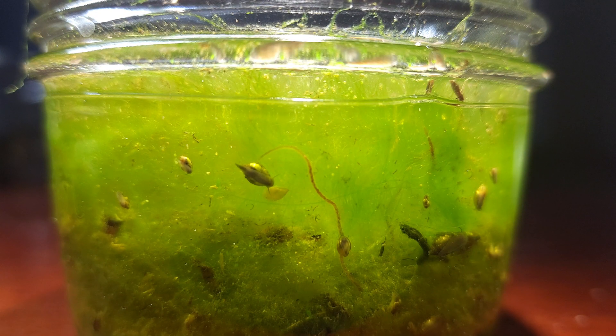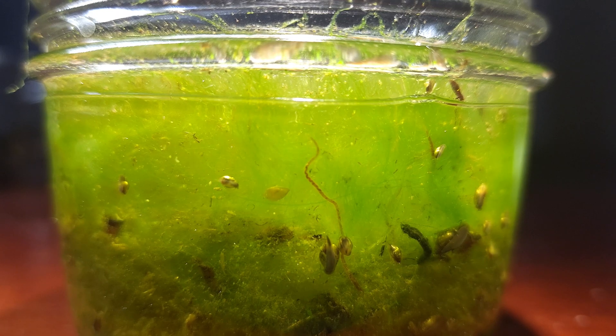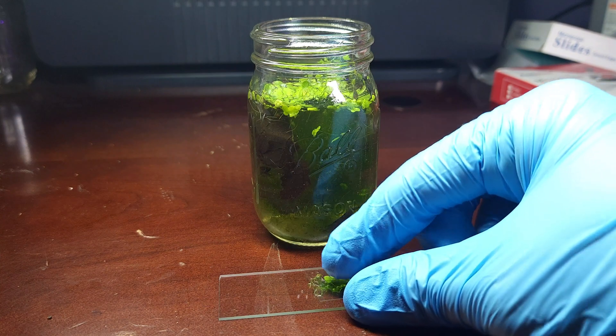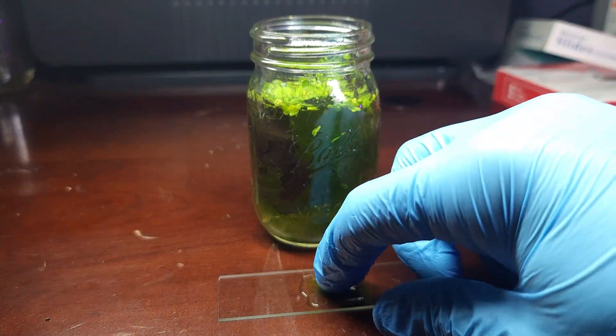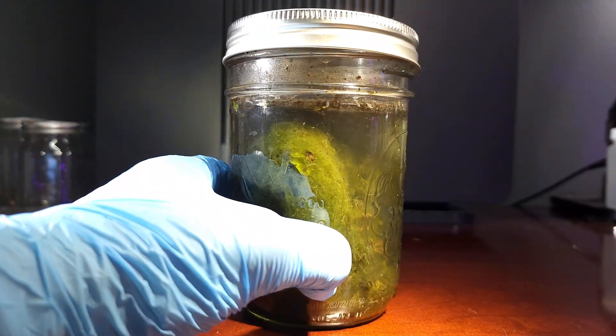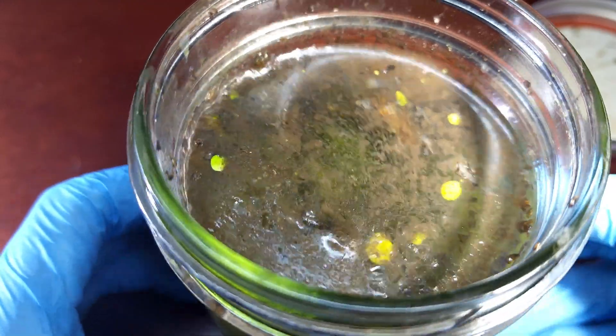Once you have a few different pieces of organic debris, you might start to notice some life even without a microscope. I like to use something like tweezers to place the algae onto the slide since it usually gets stuck up in the pipette and gives me way too big of a sample. Eventually when it starts decaying over a couple days, it will soften up and be a lot easier to grab with a pipette.